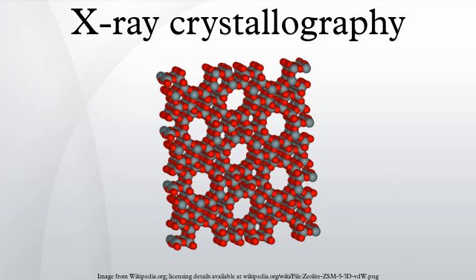Protein crystals are almost always grown in solution. The most common approach is to lower the solubility of its component molecules very gradually. If this is done too quickly, the molecules will precipitate from solution, forming a useless dust or amorphous gel on the bottom of the container. Crystal growth in solution is characterized by two steps: nucleation of a microscopic crystallite, followed by growth of that crystallite, ideally to a diffraction quality crystal. The solution conditions that favor the first step are not always the same conditions that favor the second step.